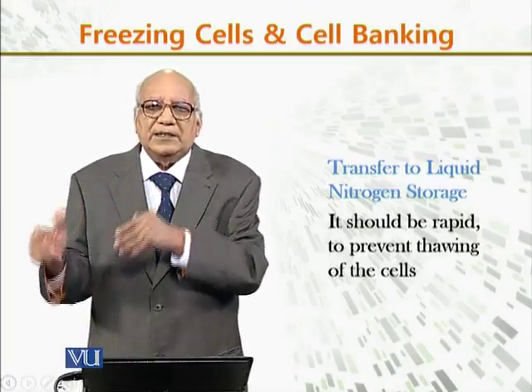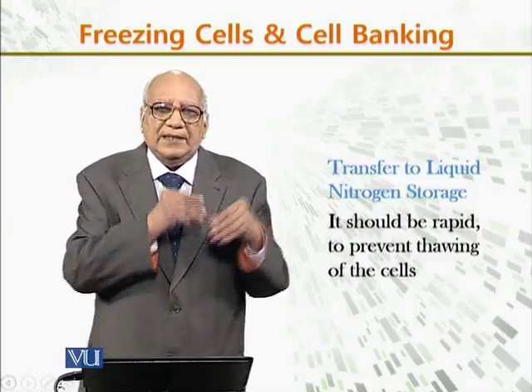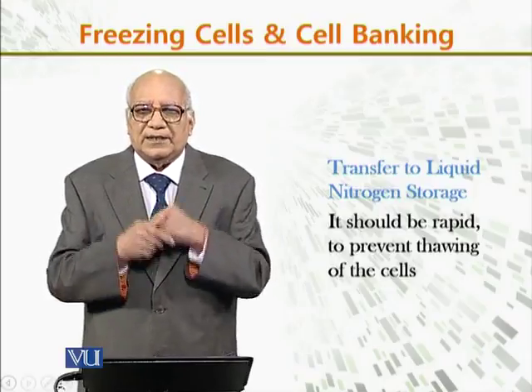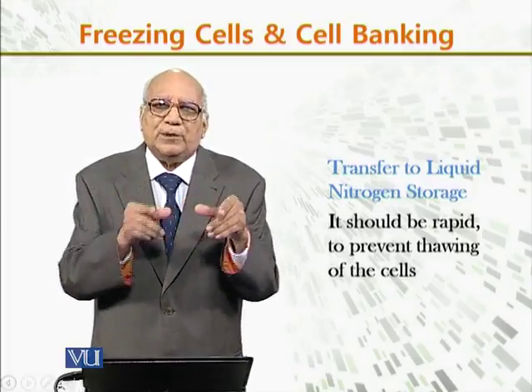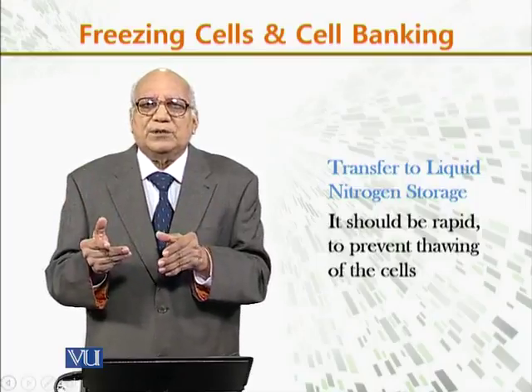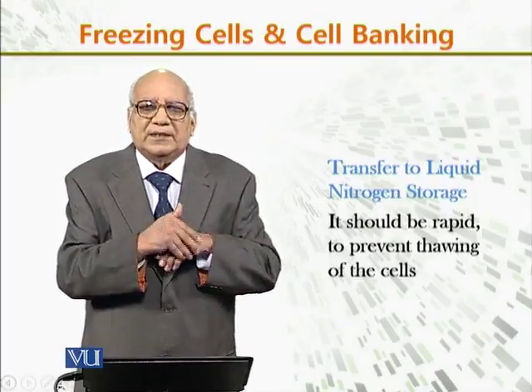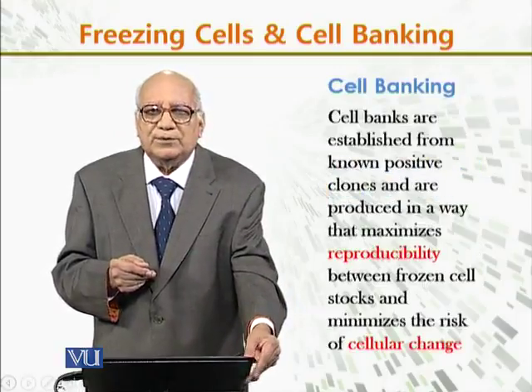That is, we take the vials from that container and put them into the cryogenic storage cylinder, which contains liquid nitrogen. And this process should be very quick. It is not that we took those cells in the morning and then in the afternoon put them in the liquid nitrogen. No, because they will thaw.